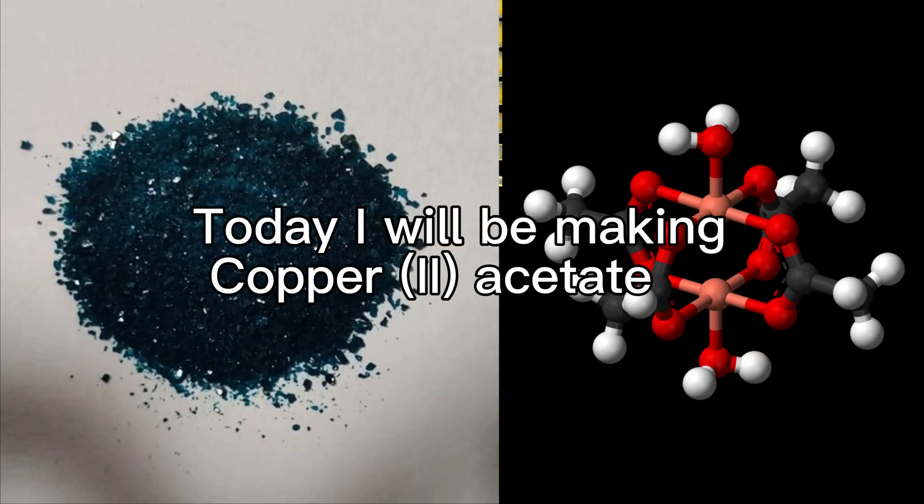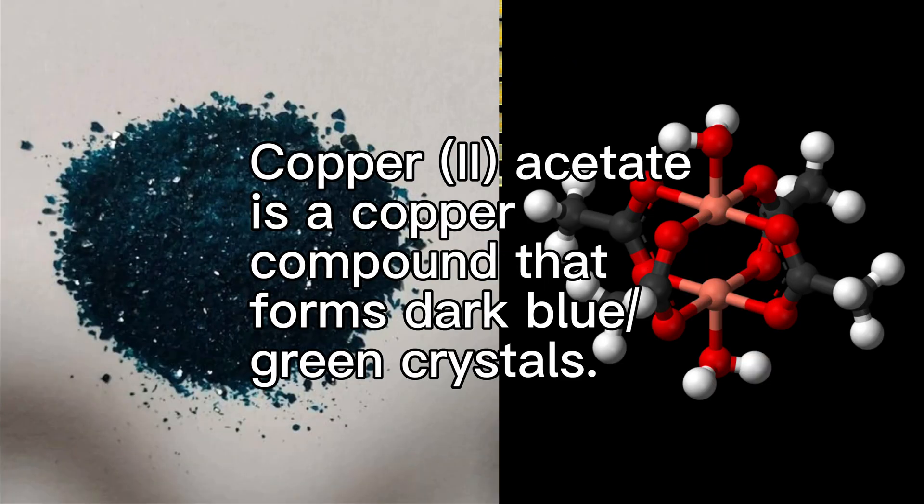Hello everyone, Niall Yellow here. Today I will be making copper-2-acetate. Copper-2-acetate is a copper compound that forms dark blue-green crystals.